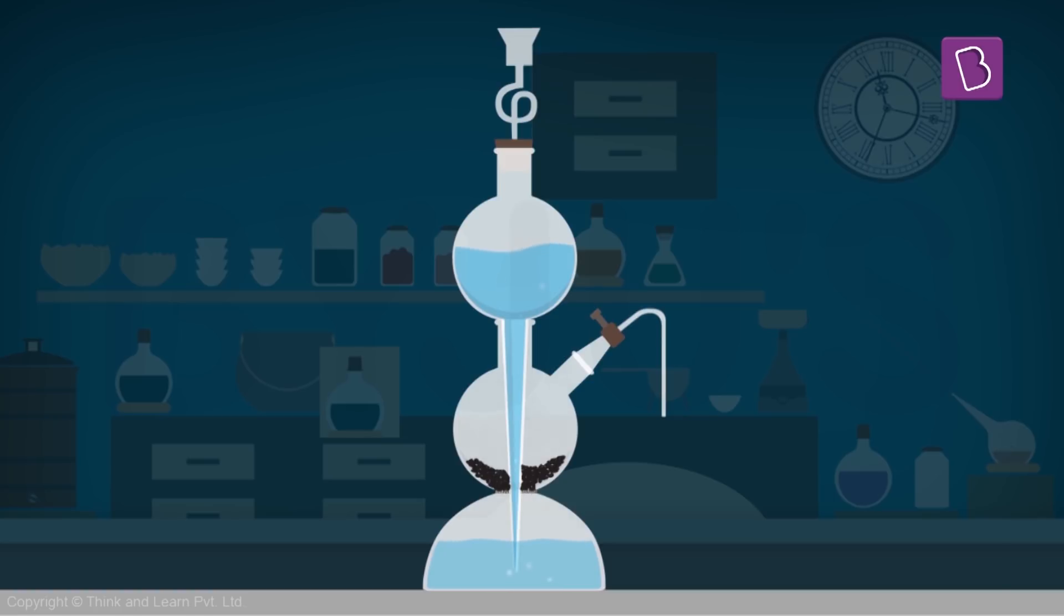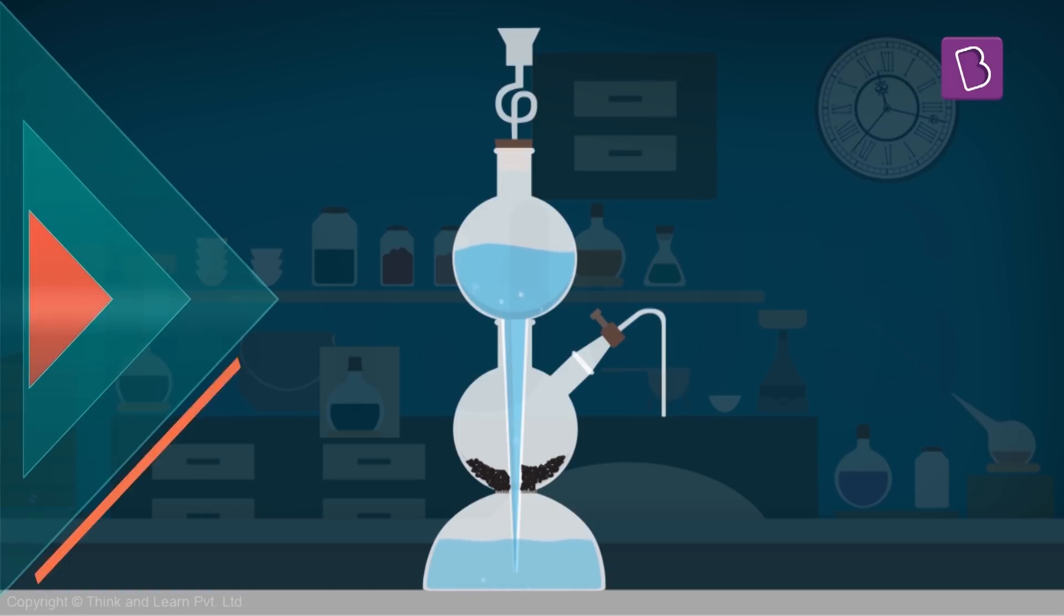Where does the H2SO4 go? Well, remember that tiny cone-like structure? It goes back up into the first globule. That's the cool thing about this apparatus. I have a way of controlling the reaction by just closing this stopcock.